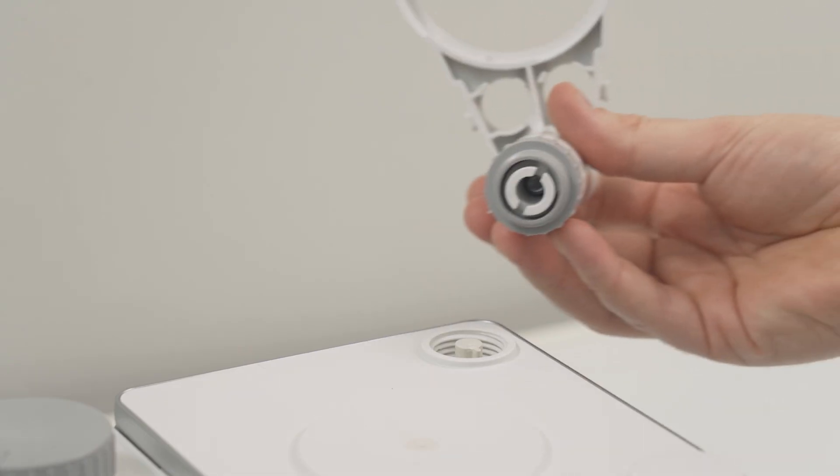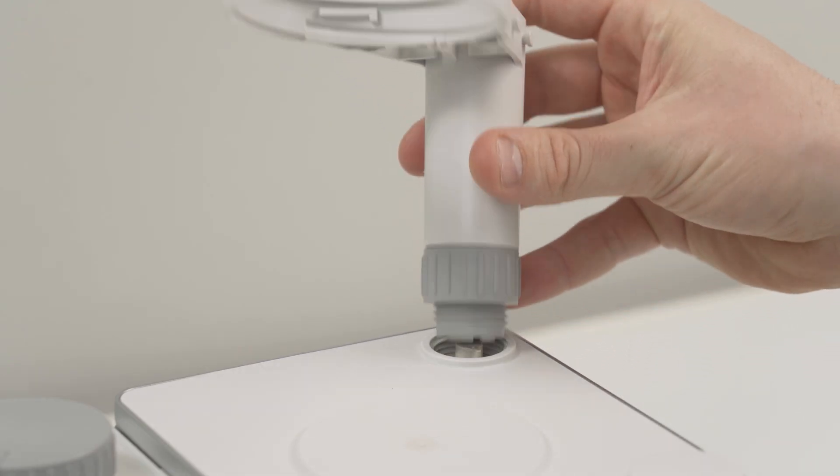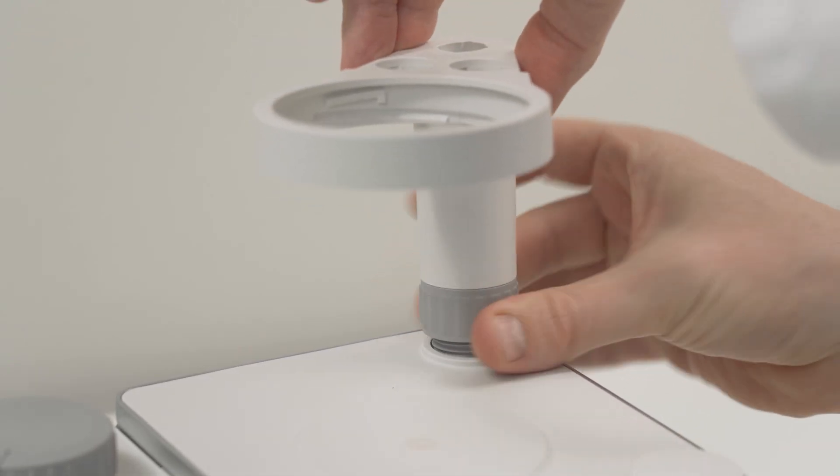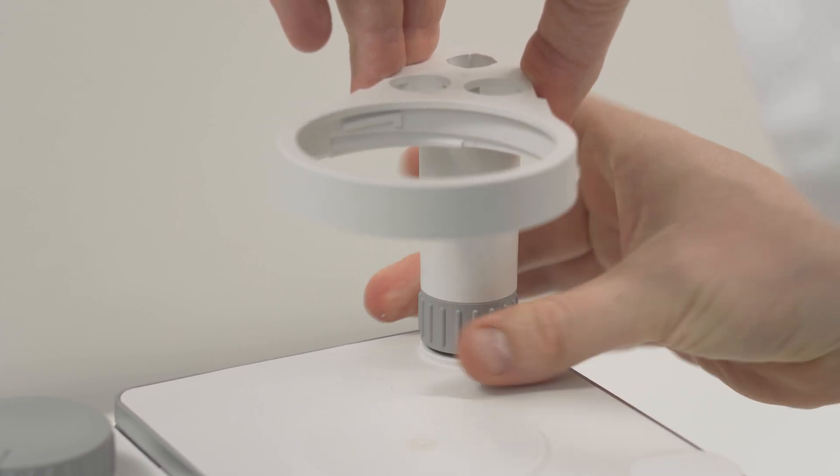Fix the titration arm to the main unit and attach the grey rubber strap. Later on we will use the strap to fix the sensor cable.